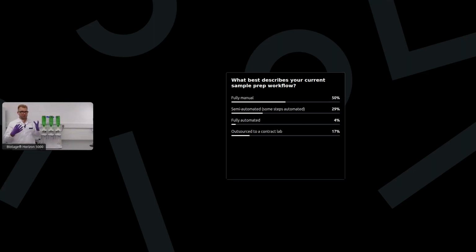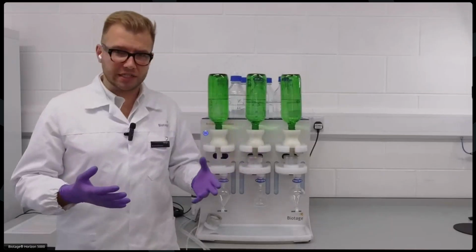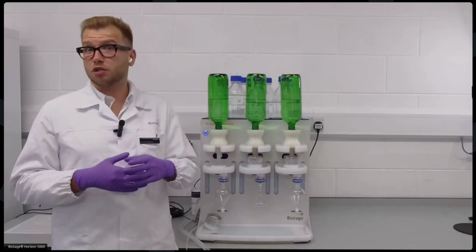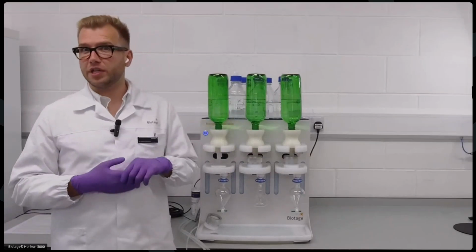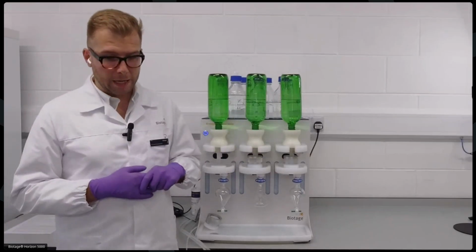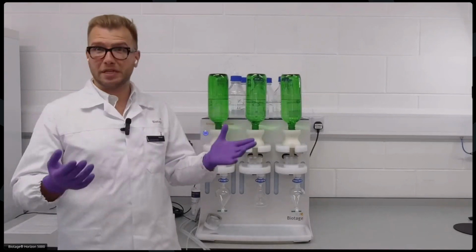And if that's something you or your lab does, you will very likely be well aware of the headaches that we normally encounter, with SPE being quite often rather slow when done manually, encountering a lot of bottlenecks, having analyst to analyst variation, and also not to mention the fact that your analysts are often exposed to various really hazardous solvents. Now, to make things worse, most environmental samples are not pristine.